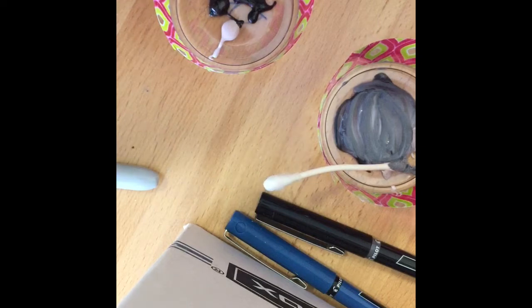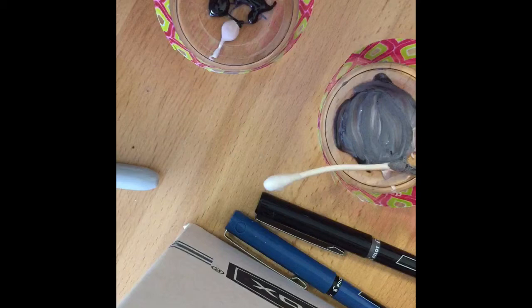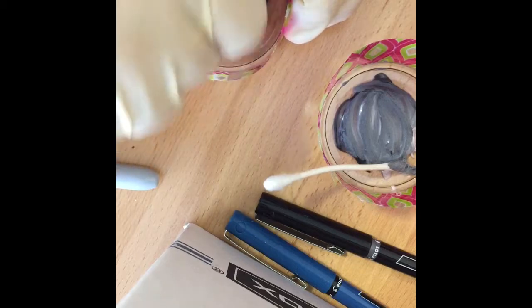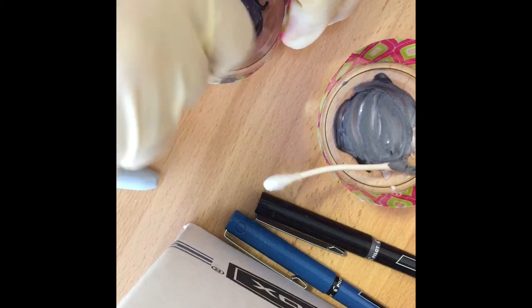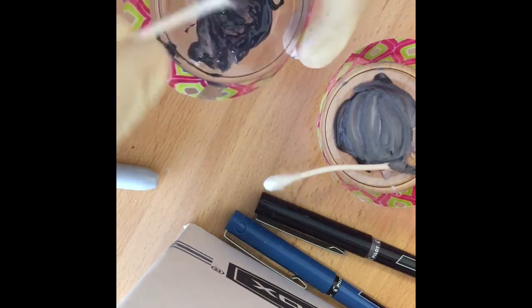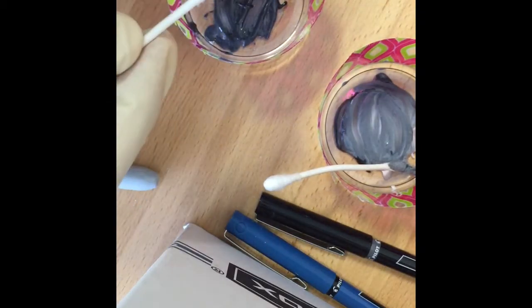Now, unfortunately, an experiment like this is not as exacting as you would probably like it. Definitely not as exacting as I would like it, but we're kind of making do and eyeballing it. Notice this has a darker complexion than the other one. That one had more of a gray complexion. This has more of the black of the resin. Woo! It smells stinky.